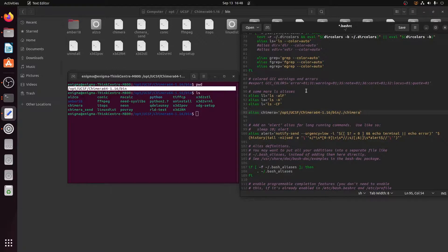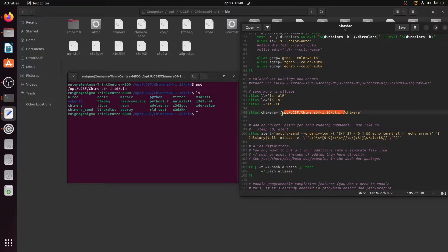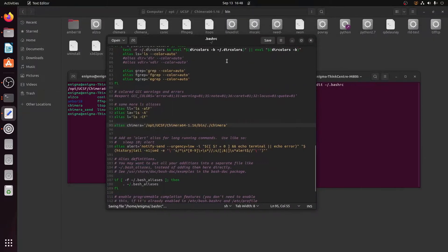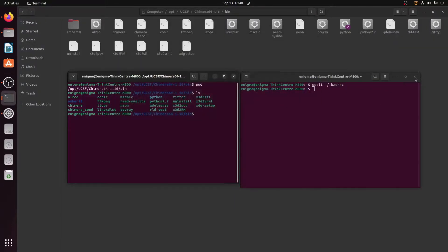Once you have copied the path where Chimera is installed, add a forward slash, then a full stop, then another forward slash, and type 'chimera'. So the full alias command points to that location and runs './chimera' — the ideal command to open Chimera from that directory. We have created this alias. Simply press Save, then close the .bashrc file.